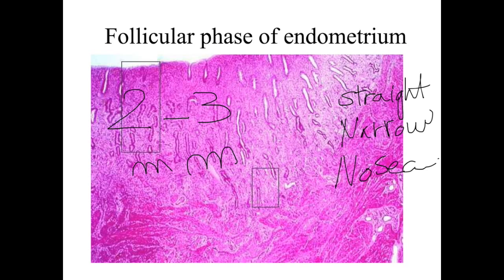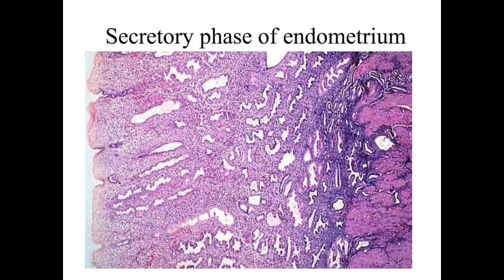Mention other change that takes place in this stage. The blood vessels actually become regenerated again, but they are not congested. So we have a regeneration of the glands, a regeneration of the endometrium to return again to its normal form of simple columnar, partially ciliated, partially secretory, and in addition, of course, to the regeneration of the blood vessels. What type of blood vessels? The spiral arteries.